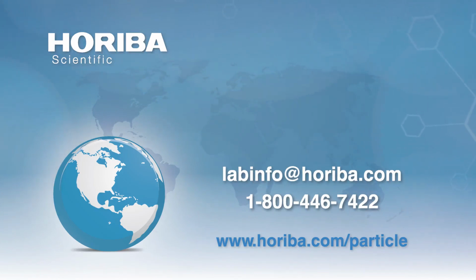Let me give the longer answer because I think it's based on a lot of assumptions about the question. When you say small to intermediate, you're thinking monomer, dimer, trimer type peptide aggregates, if that's the right word. I know from experience that when we work with proteins, even full proteins, that are well behaved in solution, we do not see anything. If you take a lysozyme monomer or BSA monomer, they just don't scatter well enough to see the individual protein molecules. That holds for the peptides too. Monomer, dimer, again, they don't scatter well enough.